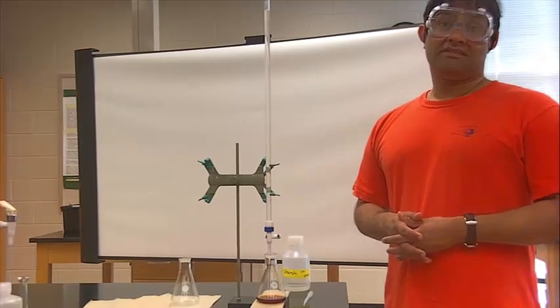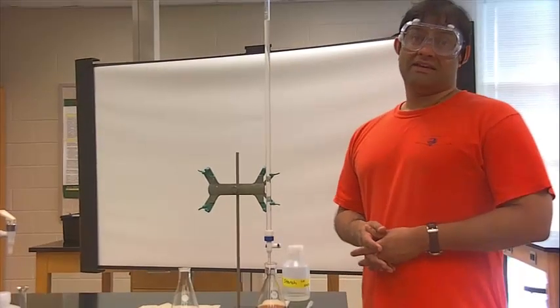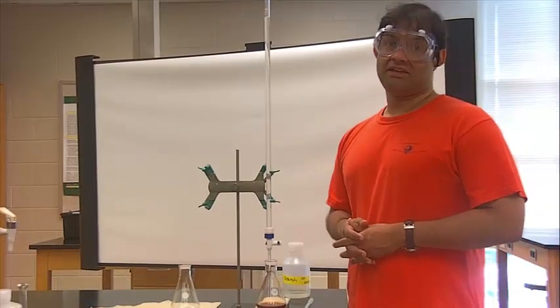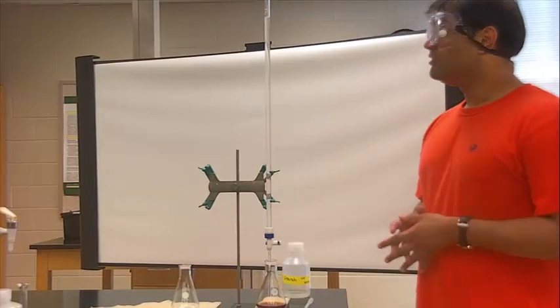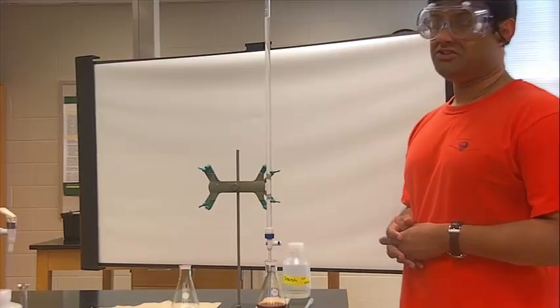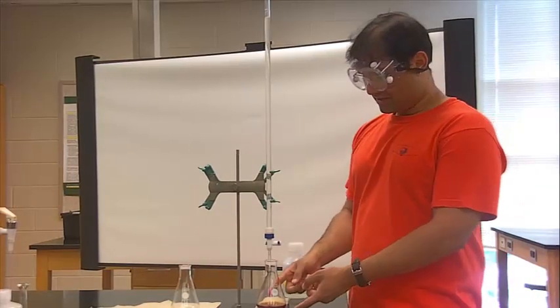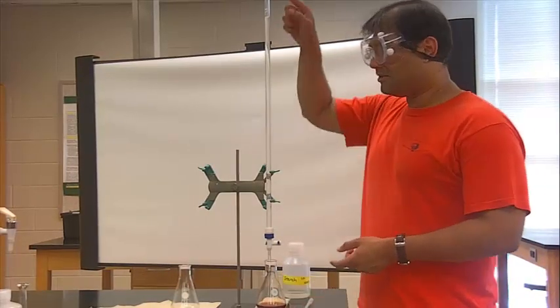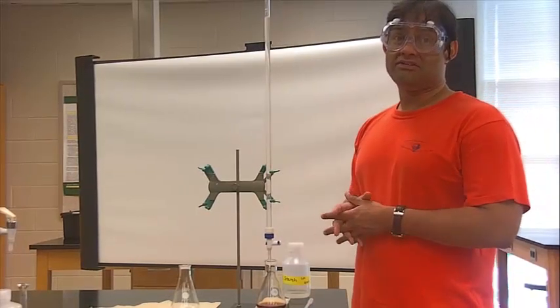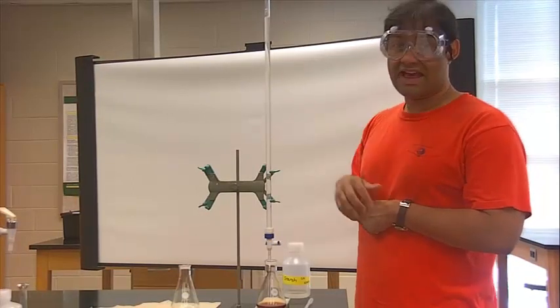The protocol says that you're going to go 2 mils minus that equivalence point value that you calculated stoichiometrically. So I'm going to do that. Before you actually perform this lab, you want to do the stoichiometric calculation to determine how much of this reacts with this. But you're not going to put the entire equivalence point. You're going to go 2 mils minus that equivalence point and then go very, very slow so that you can get an exact reading.